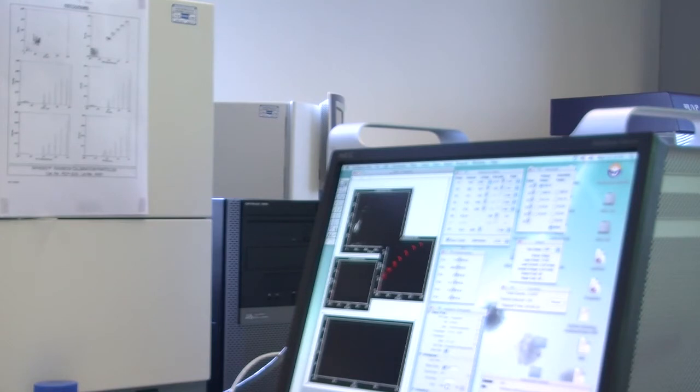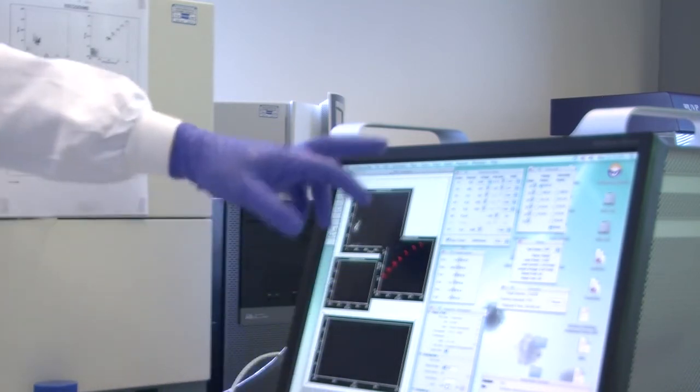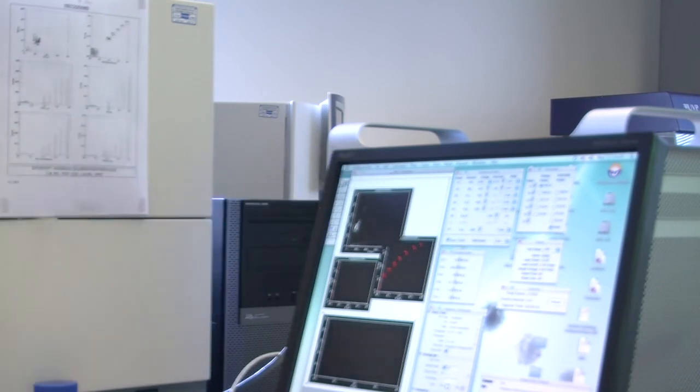So we might put through some cells that we haven't added antibody to. In our case, we can use isotype match controls, or whatever. But what you cannot do is say, yes, they are fluorescent. Now, obviously, if they've got loads and loads of a really bright fluorochrome on them, then even on minimum setting, we're going to have a peak here. And you can say that even at a minimum setting, they're obviously fluorescent. But people think you can put it on, and it will tell you, are they fluorescent or not? No, it won't. It will tell you, are they fluorescent compared to. That's why we have to use appropriate controls. Okay?